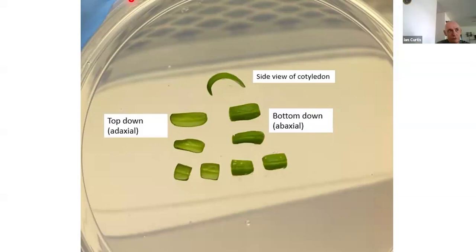So if you used acid, what would be the molarity and the time, would you say? Did we ever even use acid? I don't know. We used it in the olden days, in the beginning, at Soteria, but it's been a long time. I'd have to go back and look at what was done. Hydrochloric acid, I think they do that in the citrus. Ah, okay, they use acid. I see.